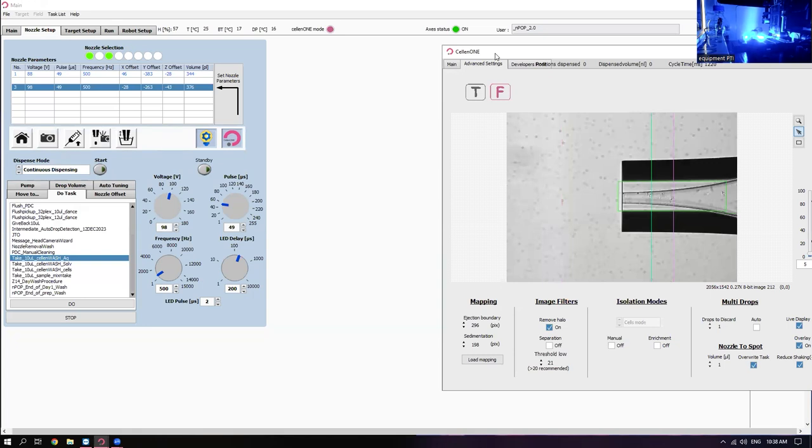So I've got a group not too far away from here that does a 384 well plate with 14 different cell samples, and they just do cloning. It's an antibody production group. So they know that if they do 20 clonal wells, they're going to get enough outgrowth with cells that are producing that antibody. So things like that have been automated to go through many different cell samples. The same thing could be done here. It just hasn't really been requested yet, I think because people are still doing a lot of different kinds of experiments. Maybe when somebody gets into a groove and says, I want to rush 100 patients through this, with these three different subsets of cells from their blood or something, then it would make sense to automate that a little bit more.